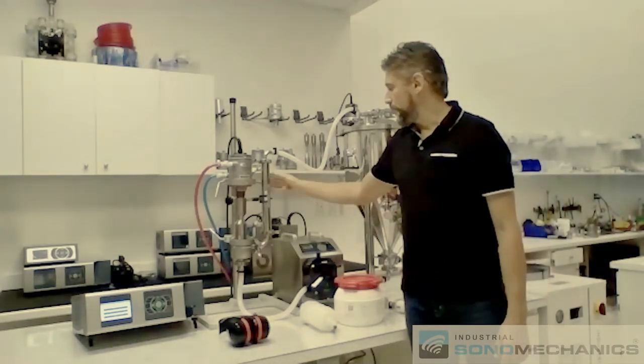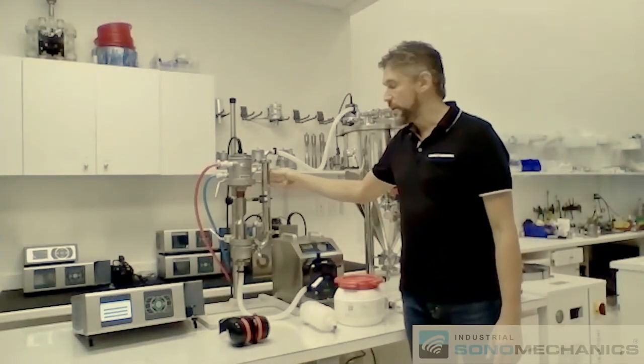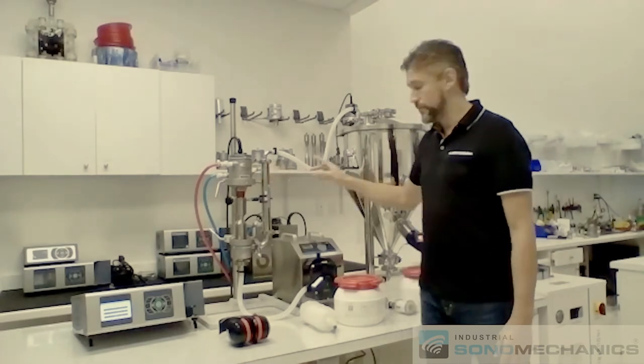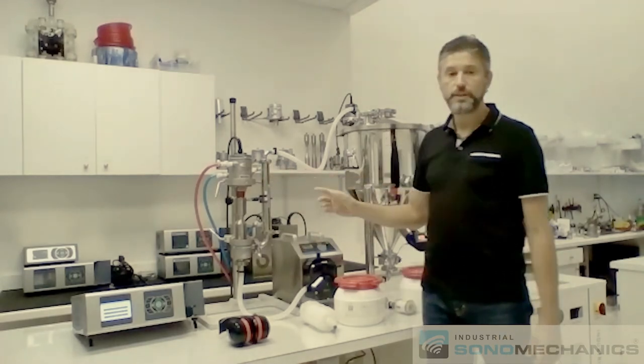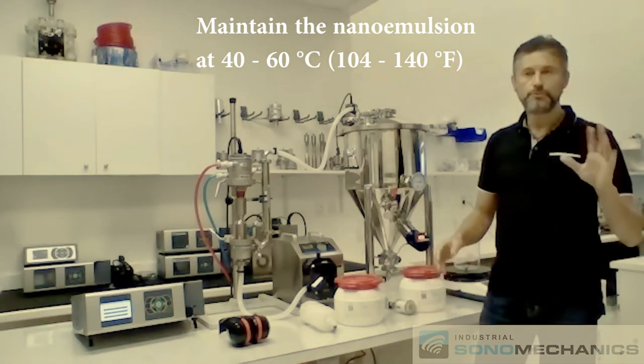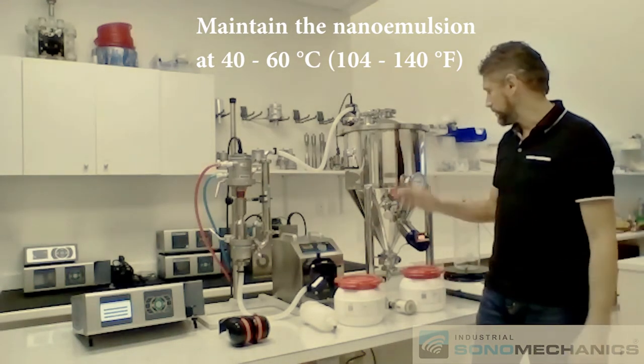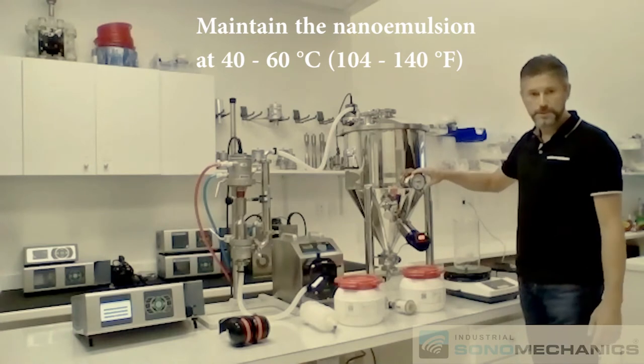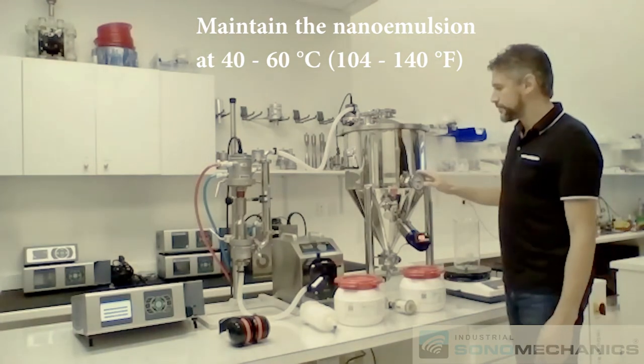It's also important to point out that this heat exchanger is there to maintain the temperature of the liquid that you're processing at the right level. We recommend approximately 50 degrees. It could be anywhere between 40 and 60 degrees throughout processing. And there is a thermometer that you can use at the tank that will tell you what the temperature is.